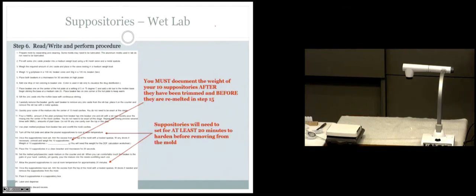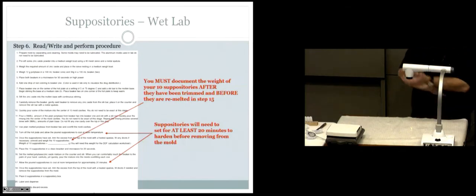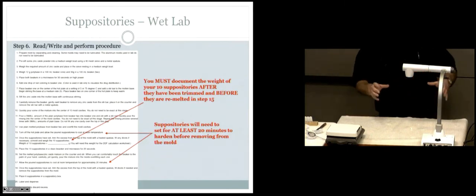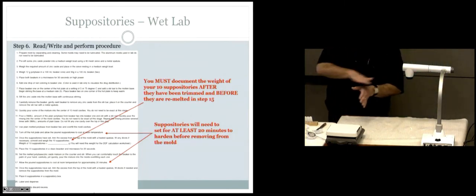So, let's talk about the procedure here. Go ahead and on your procedure, let's do this first. Just make a couple of notes here. Put a big old star by step 14. See where there's that fill in the blank under step 14 where it says to write down the weight? That's extremely important. You're going to go through a bunch of work. In the end, you're going to have these suppositories set up for 20 minutes, and they really do have to wait for 20 minutes. After 20 minutes, you're going to trim them. I'll talk about that here in a minute.